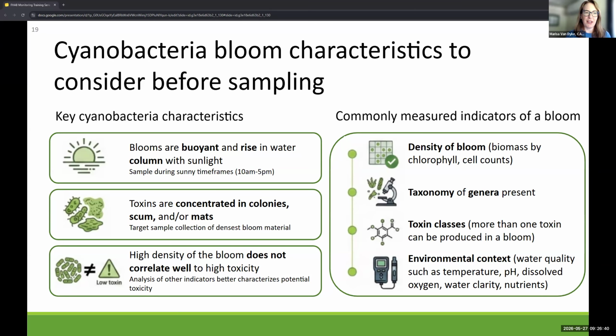And we can use handheld tools to measure water temperature, pH, that kind of thing. And altogether, these analyses are really useful to understand the cyanobacteria community, how hazardous it is, and understand a little bit more long-term, how you can then learn a little bit more about your water body and the bloom to then refine the costly lab analysis over time for your program.